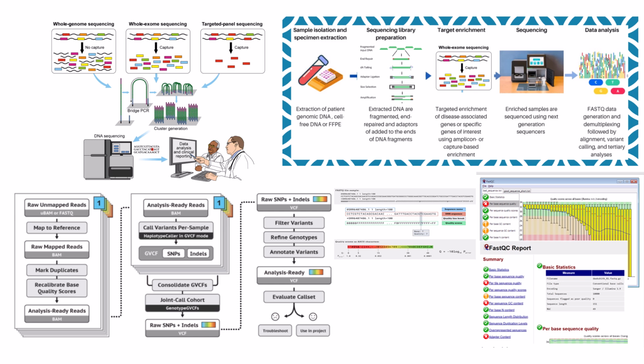This is it. This is where the software actively scans that mapped, recalibrated patient data, the BAM file, to pinpoint all the specific genetic differences. The key tool here is often something like GATK HaplotypeCaller. HaplotypeCaller. Okay, and what's it looking for exactly? It scans along the genome, looking at the aligned reads covering each position, and tries to identify anywhere the patient's sequence consistently differs from the reference.